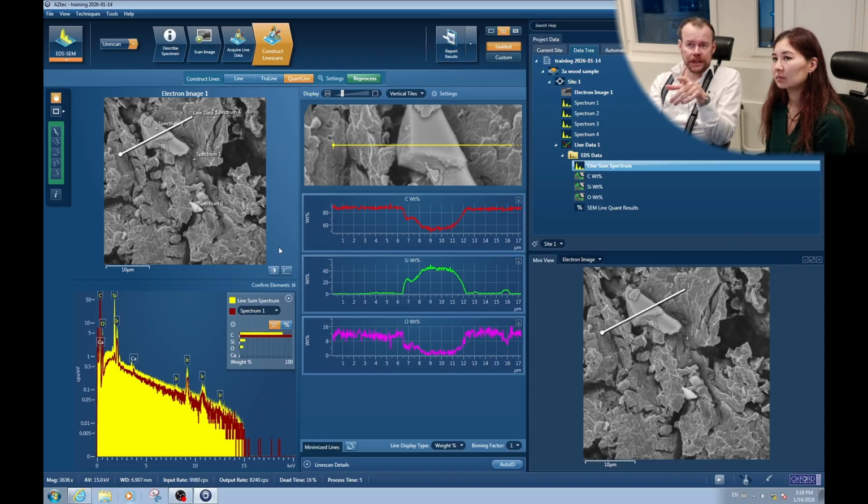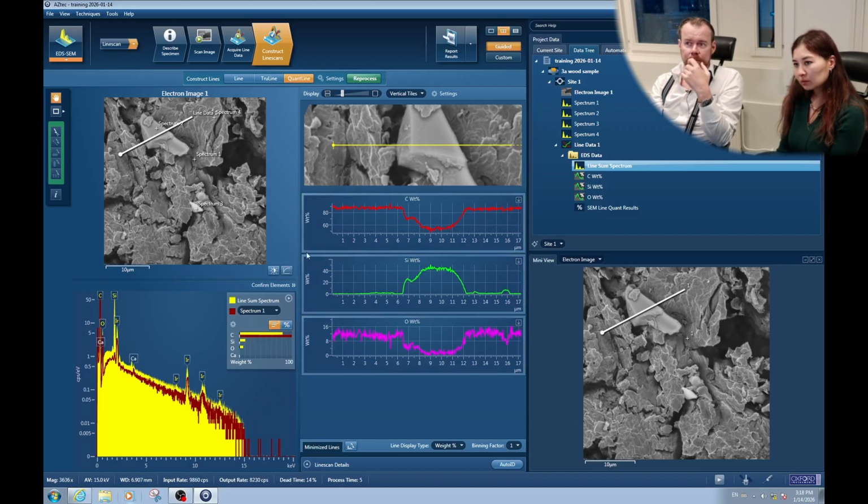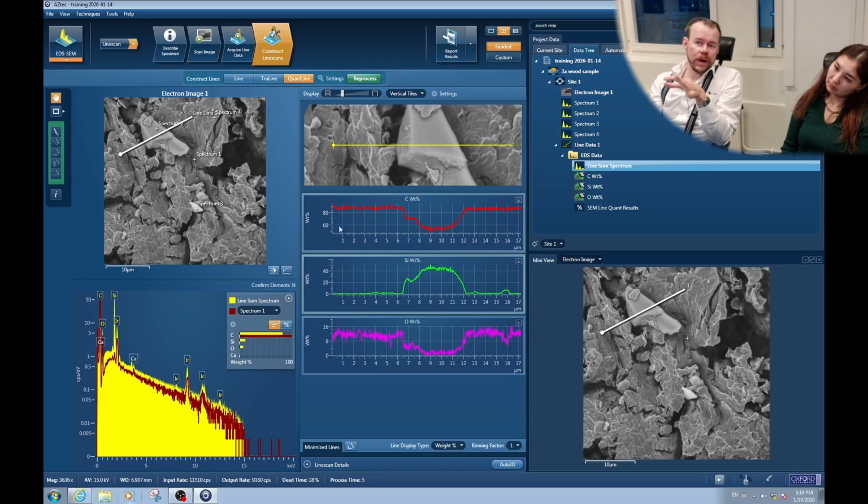If I want this particular image, I can export that as an image. If I want this spectra, I can export it. And if I just export it like that, then I get that blue-yellow bitmap image. But in a publication, you would like to replot it in a more professional way. So EMSA is a comma-separated value data table, and then you can replot it. Same thing goes here. You can choose to export CSV or bitmap images. So that's the way I like to do it.